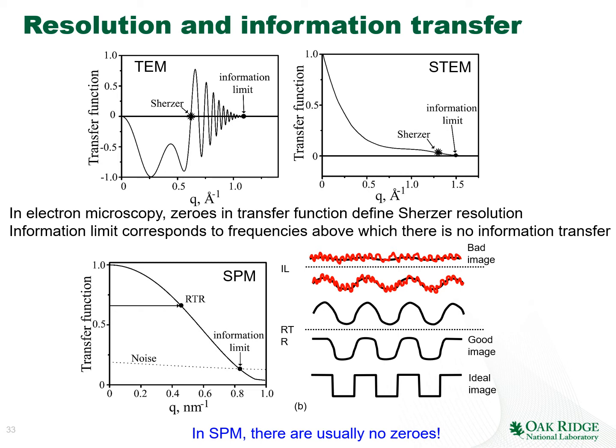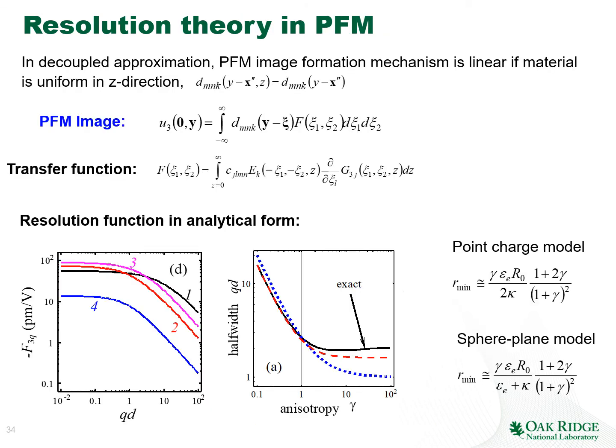So if we go in this region, we still see the periodic features, but their magnitude is no longer equal to the ideal image. Now, if we add the noise to the system, we can still see features, but they're corrupted by the noise. So once we stop seeing the features, when the noise becomes more visible than the features, this means that we're in this region, so we move further than the information limit.